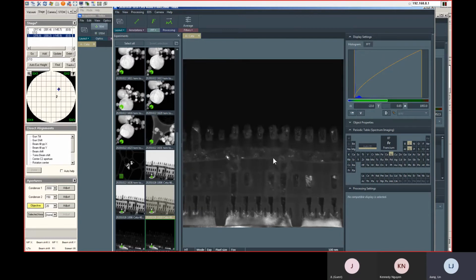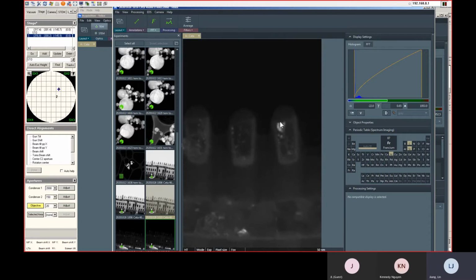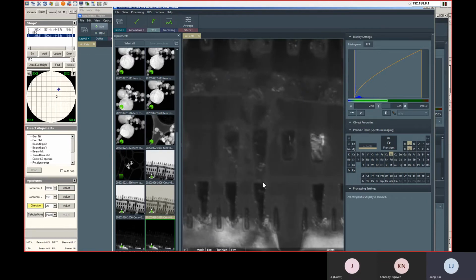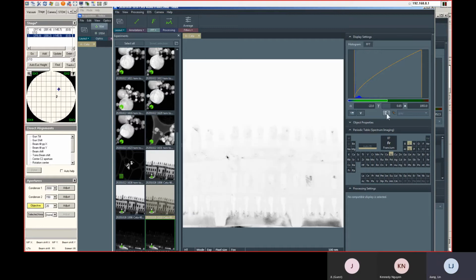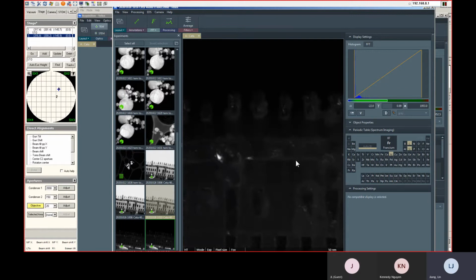Okay, so this is your dark field imaging. You see here, this is the green. The screen has that orientation we just selected. Same here. Okay, inverse contrast. Okay, this is how we take a dark field imaging.